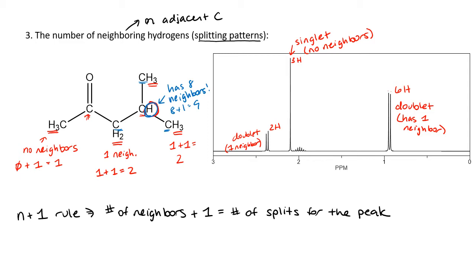Now the hydrogen that represents the peaks are here. Now it's very difficult to show 9 splits on an NMR spectrum, and it's not always going to be that clear. But what we can see is we have a set of splits representing that one hydrogen where we have many, many splits.